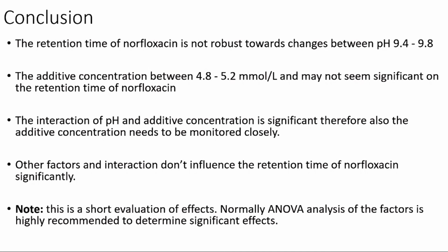However, as we expanded our table and looked at the interactions, we've seen in fact that when the pH value and additive concentration interact, we have quite a strong effect on the retention time, which we would normally not have seen if we hadn't applied design of experiment.